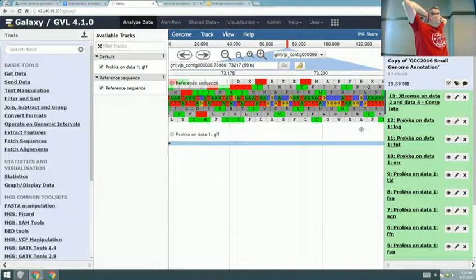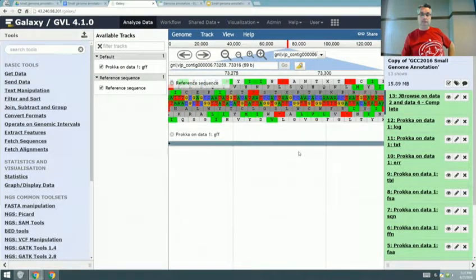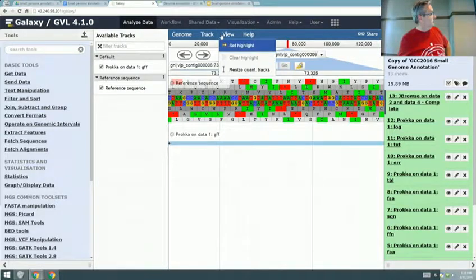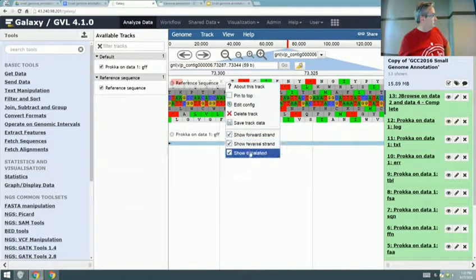Oh, so you're just using the frame attribute of this to color it. You still don't see it overlaid on the text. But they're different colors. It does make it a lot easier, and we don't use the colors for the sequence. No, that will drive you insane after a while, those colors. Does me. You can turn it off on the view menu somewhere. It's probably buried in there somewhere.